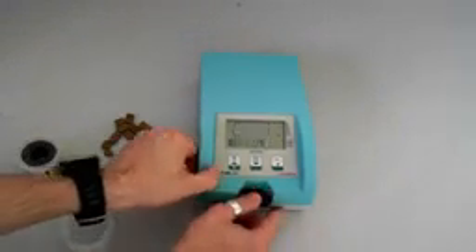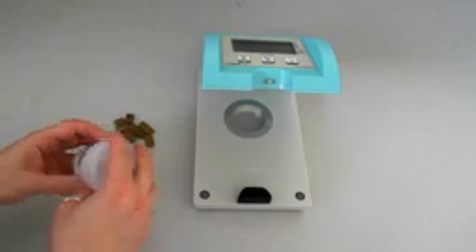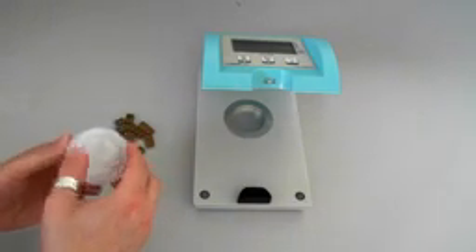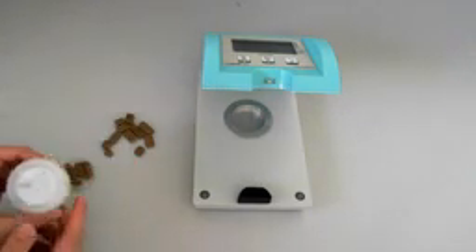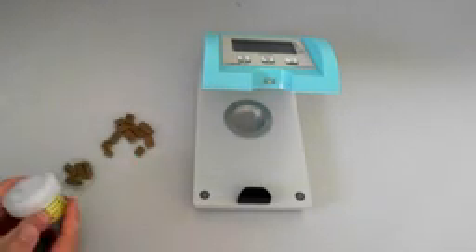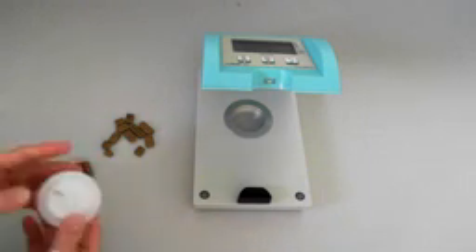Once I have finished, I can just remove it and place it back into the plastic container, and it's still ready to be used — good for three to five years. So pretty simple, pretty low cost of maintenance.